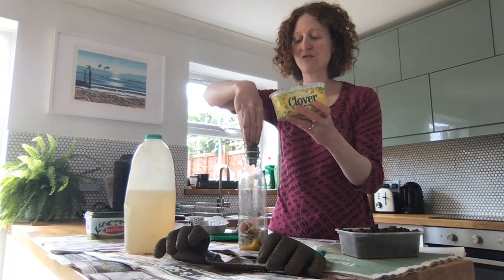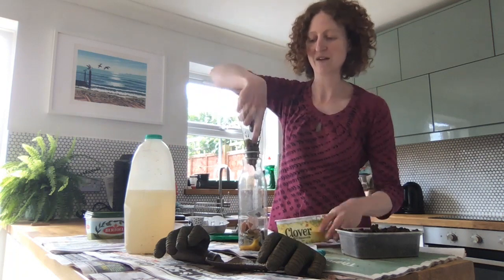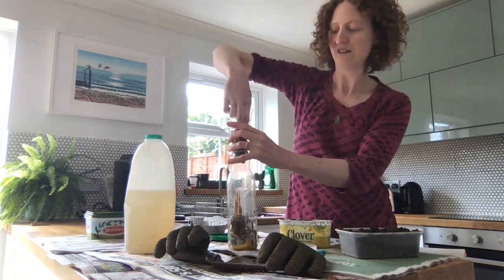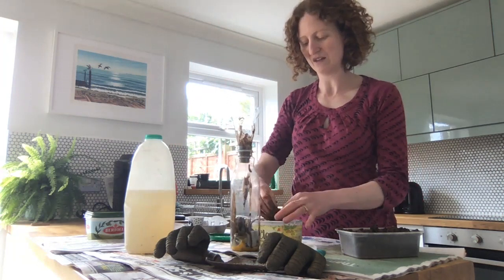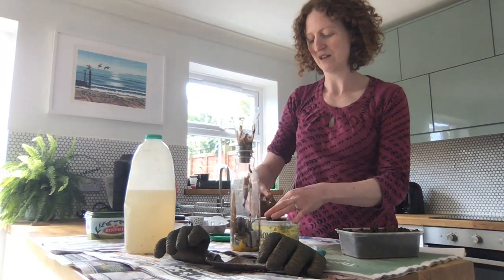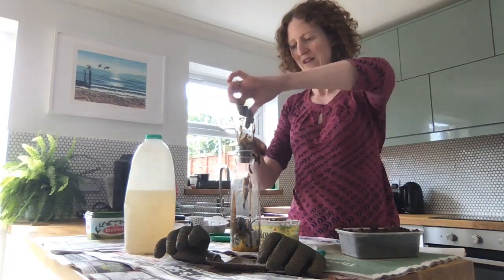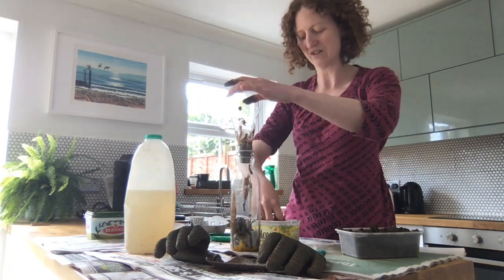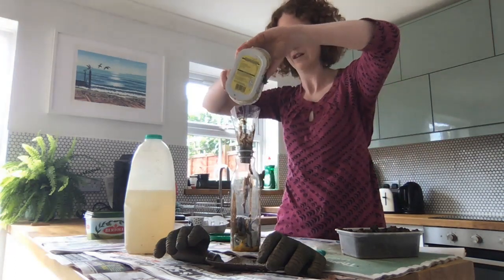So I'm going to try and push into here some of our gloopy, yucky mud. This is going to be a bit messy, so I put down some newspaper to try and make it a bit easier. As well as the mud, we've also got sticks and leaves all mixed in here as well. So it's going to be a bit tricky to get it in. And because we've got clay around this area, it can also get stuck in here and get hard to push down. So I'll help it in.